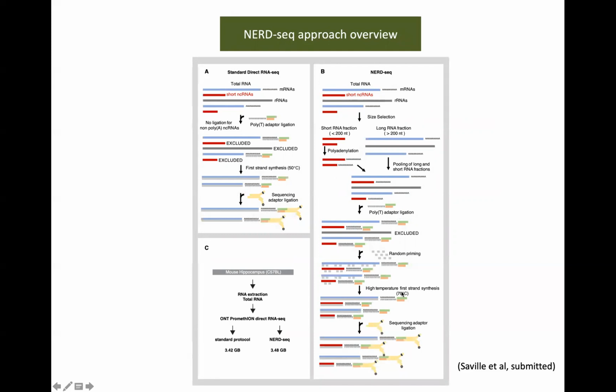But what we noticed when we were optimizing this approach is that because of the high temperature, we did have significant RNA degradation. But this was mitigated by including random primers that coat the RNA molecules and stabilize them during this treatment.